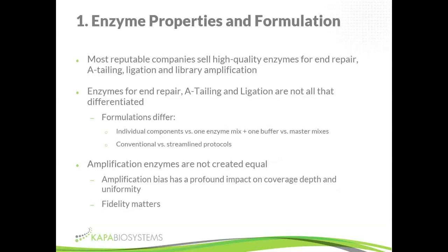Enzyme concentrations differ, and enzyme purity differs a little bit. There are situations where some kits provide all the components separately: one or two enzymes, a buffer, magnesium chloride, and some nucleotides, all supplied as individual components to go into a reaction. That's being phased out now, but there are still some of those kits around. An improvement on that was supplying one enzyme mix and one buffer, so at least you only have two components to pipette for every reaction. And then some companies just pre-mix everything for you, so you have a master mix.